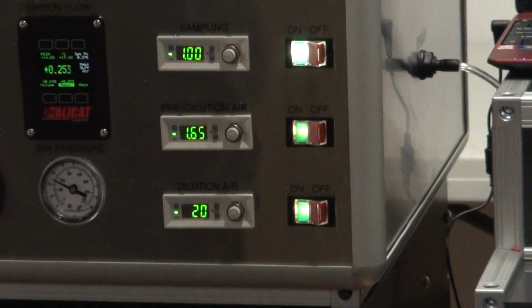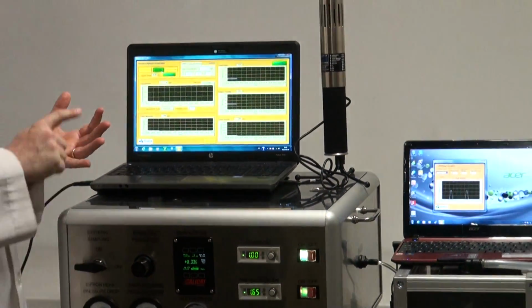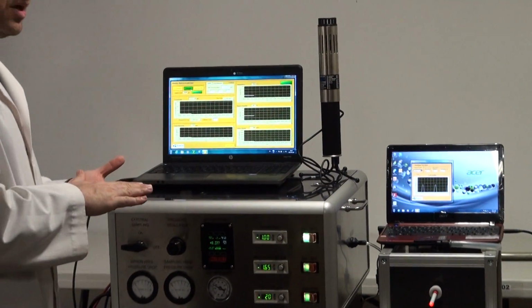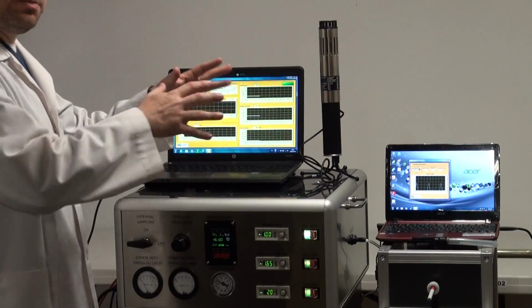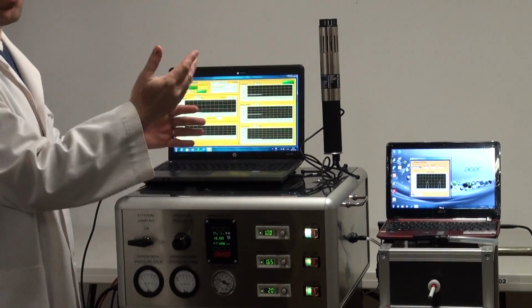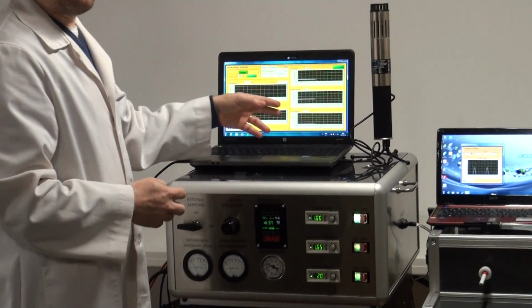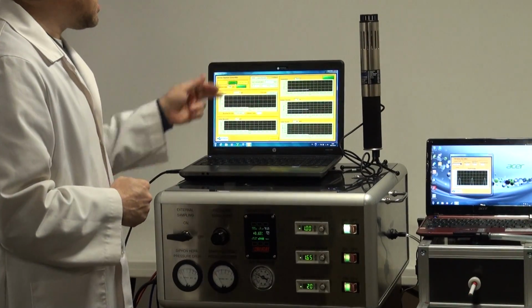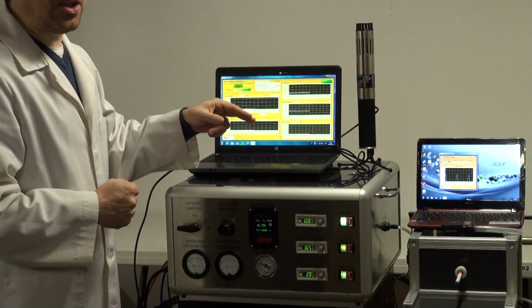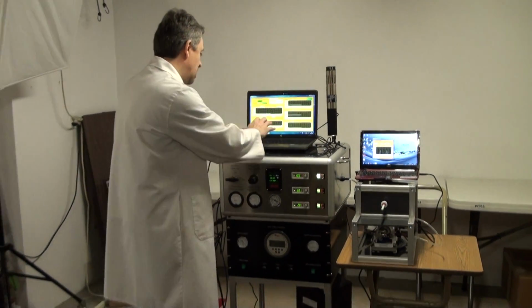We have connected with the software a gas monitor that measures CO, CO2, temperature, and relative humidity. In a real setting, this monitor will be inside the inhalation chamber or connected to it, so that this information about the CO and CO2, which is very important for in vivo exposures, as well as temperature and humidity in the cage, is integrated with the siphon.